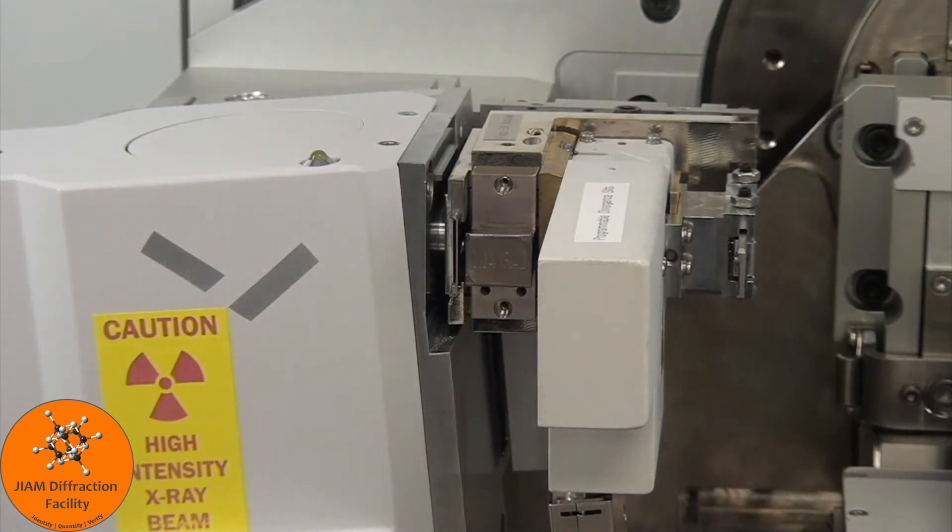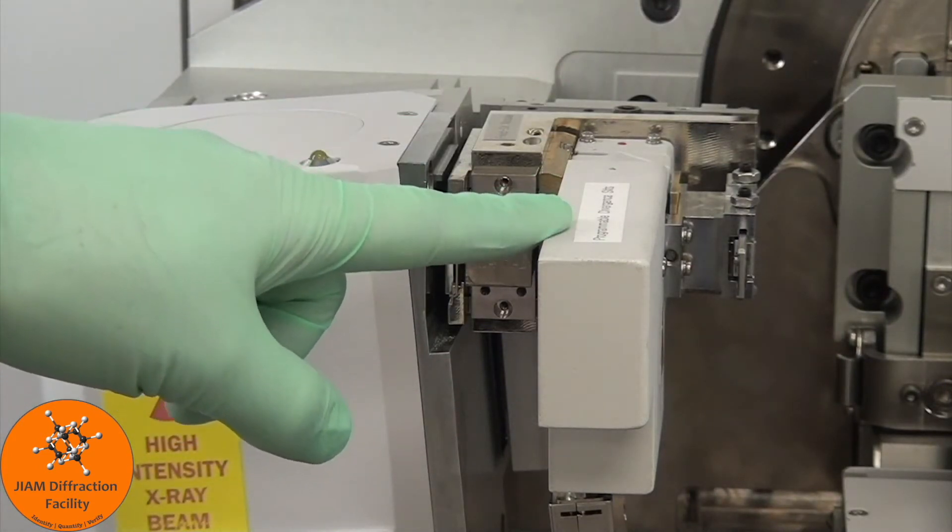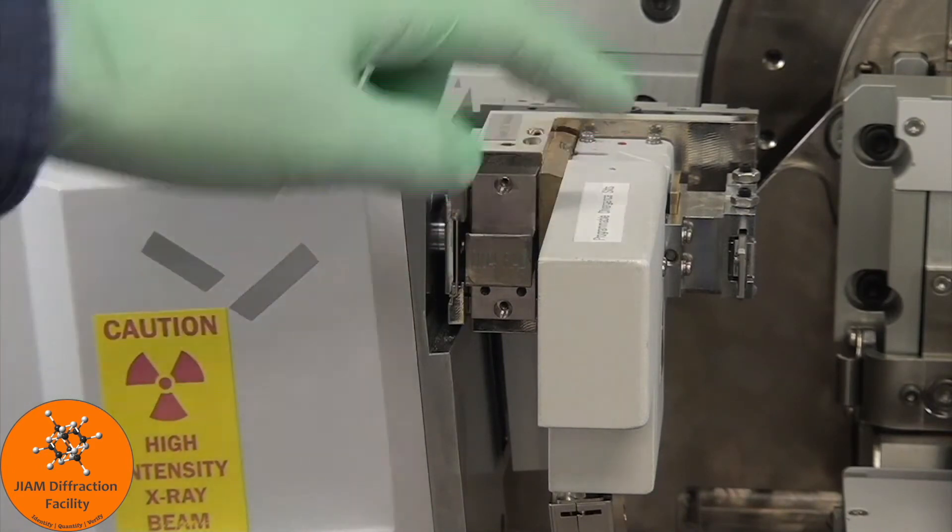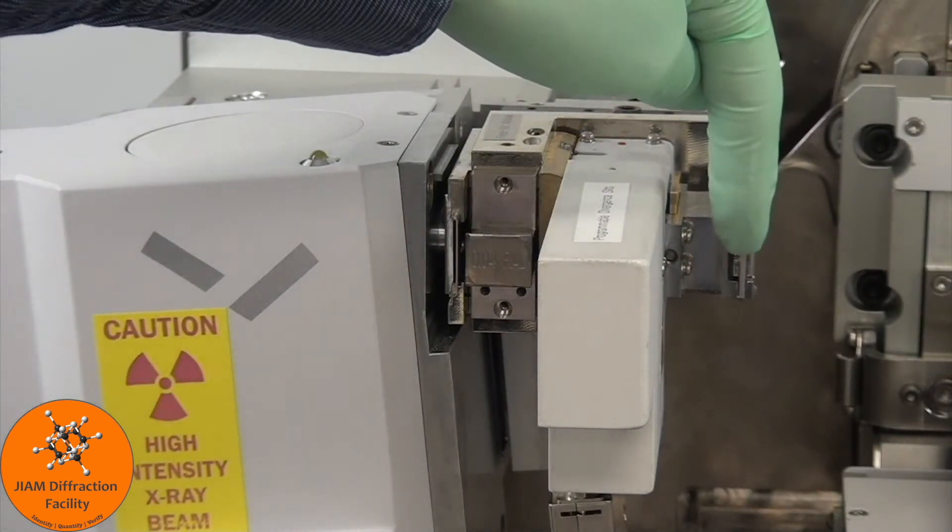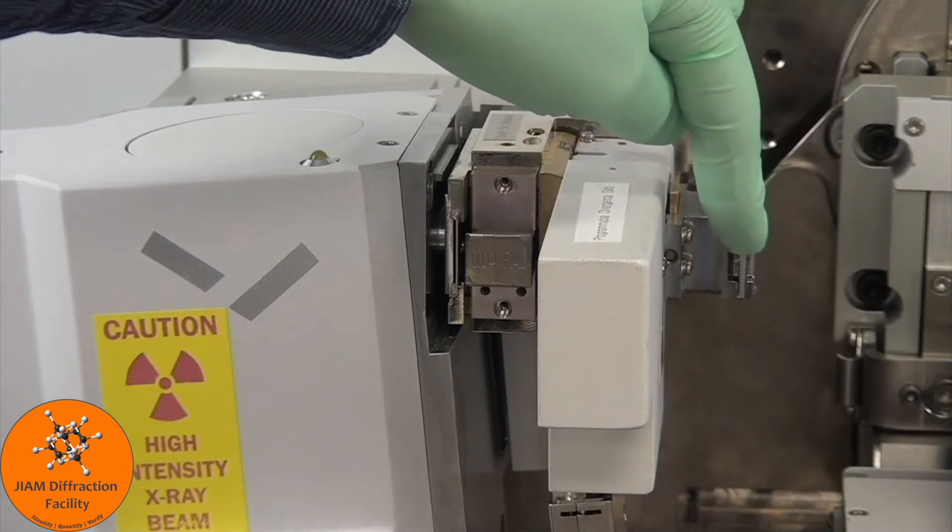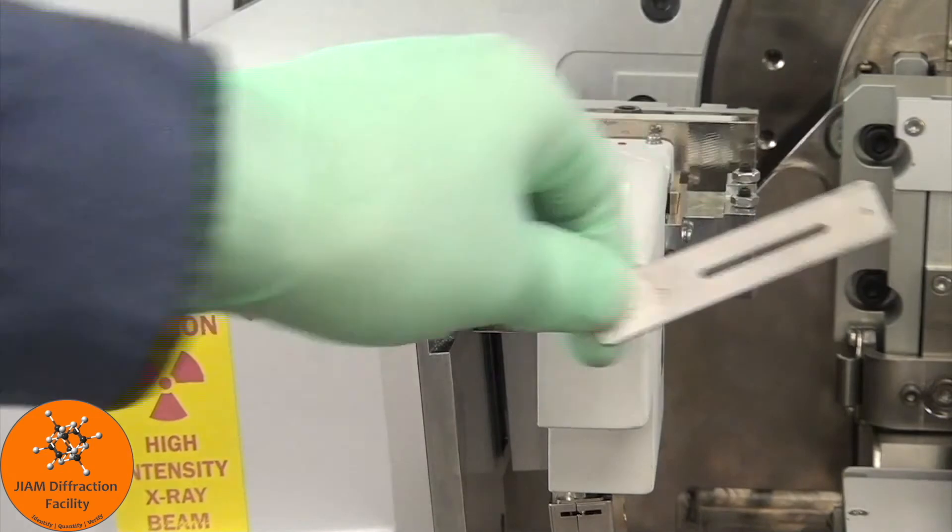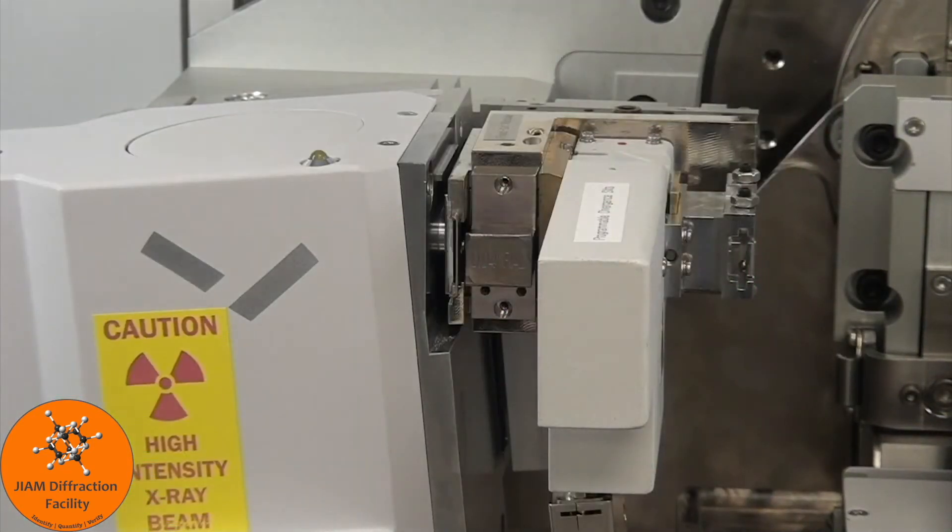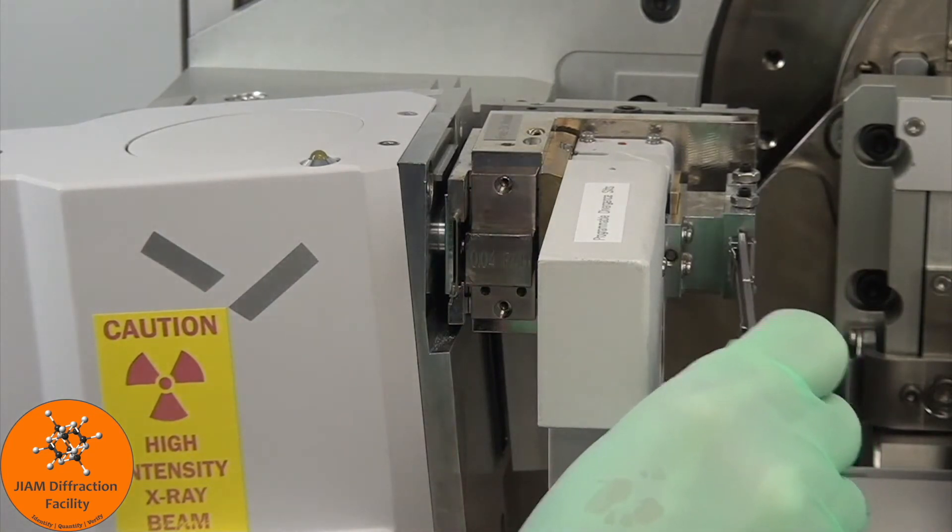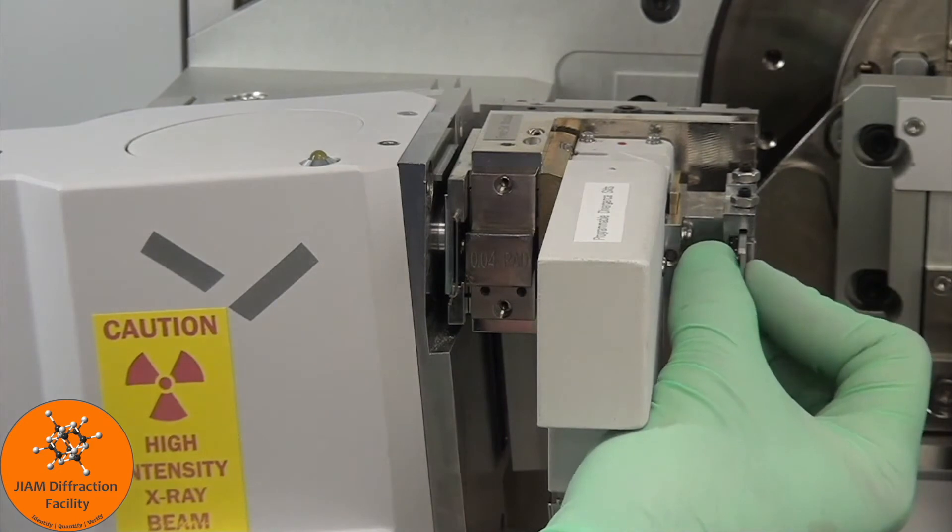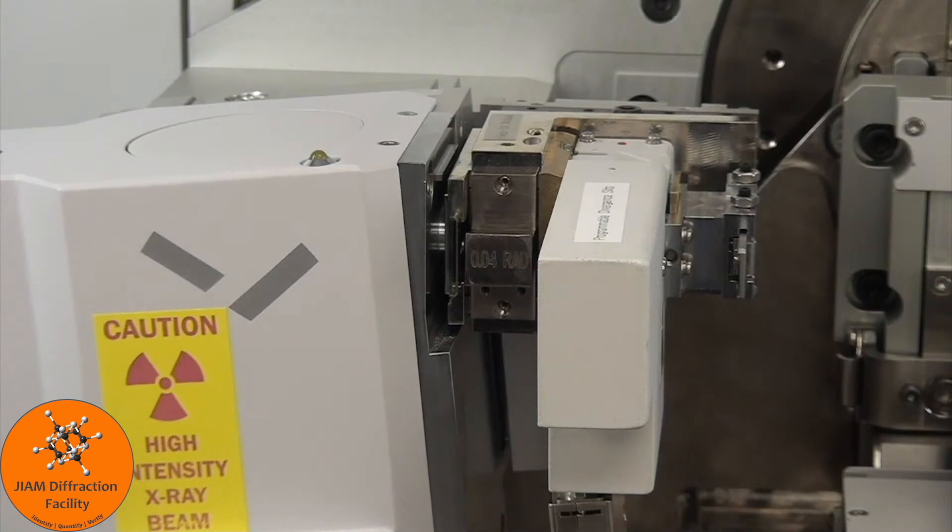Also, for alignment purposes, we want to use the smallest divergent slit possible, which is 1/32nd. Remember that the anti-scatter slit should be 2 times whatever the divergent slit is, so this needs to be 1/16th of a degree. I believe right now I have half of a degree in there, so I will change that out for the 1/16th. Just push all the way in and pull back until it clicks. And those are all of the changes for the incident beam side.